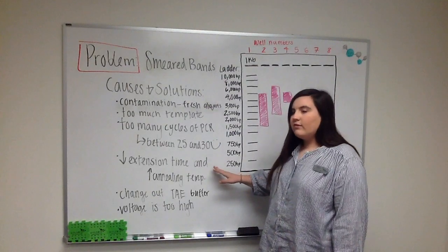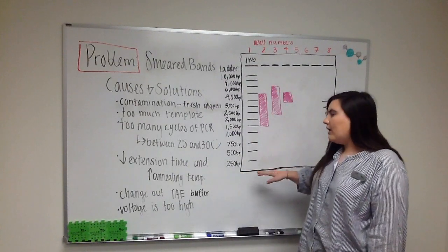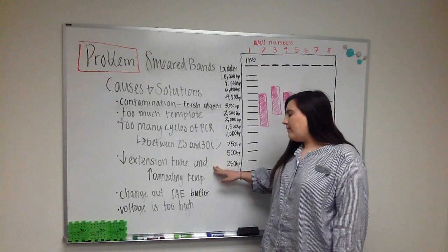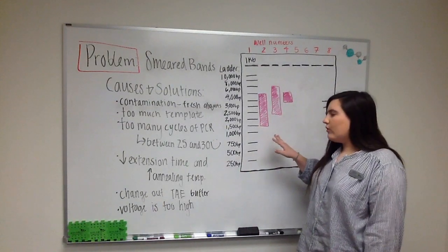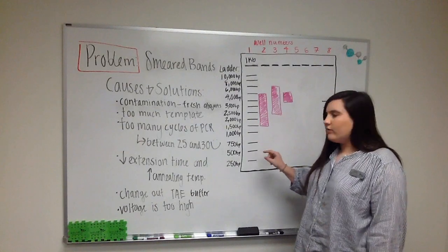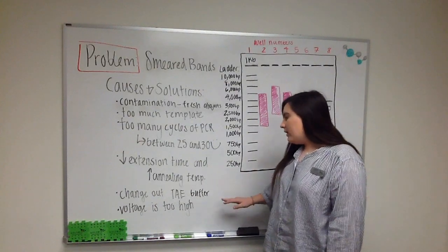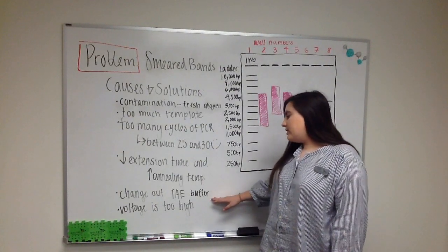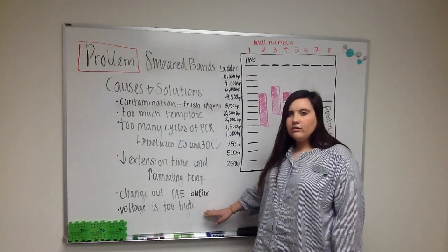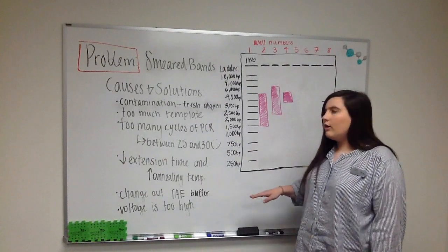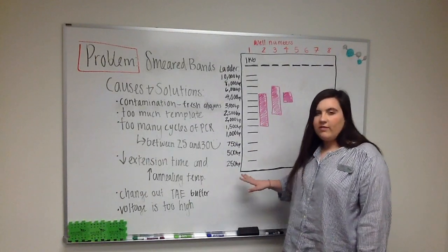Another two-fold step that you could take to try to reduce the smearing is to reduce the extension time and increase the annealing temperature. This might make your primers more specific to what you're trying to amplify resulting in a nice tight band. You could also try changing out your TAE buffer and your voltage might also be too high. Try lowering the voltage and then running it for a longer amount of time and see if that helps with the smearing.